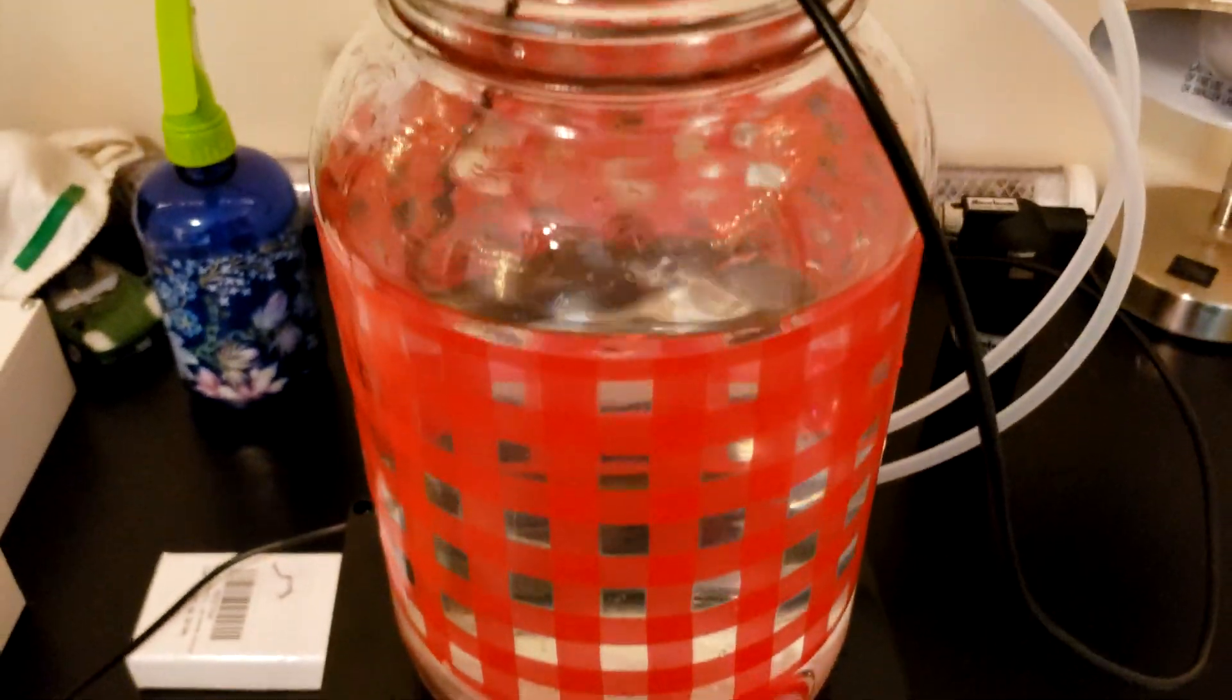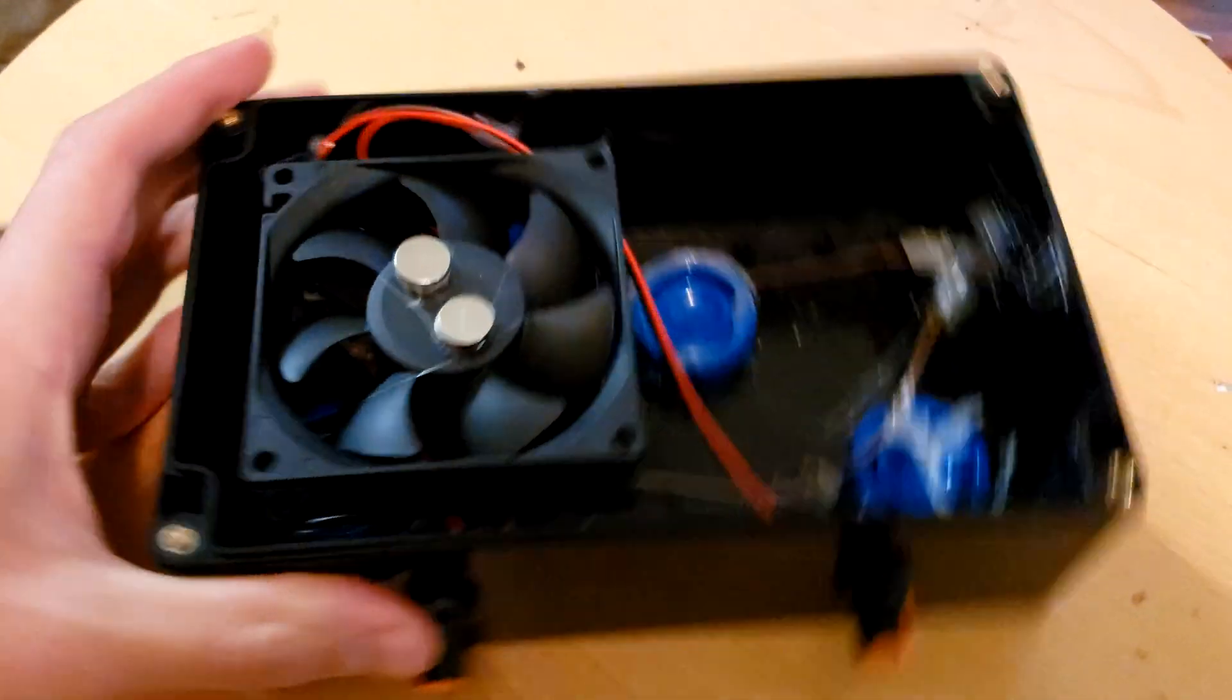Check it out. Okay everyone, I hope this crusty table is in full HD. This is what we're doing today. We got the magnetic stir plate that is broken, not working anymore.